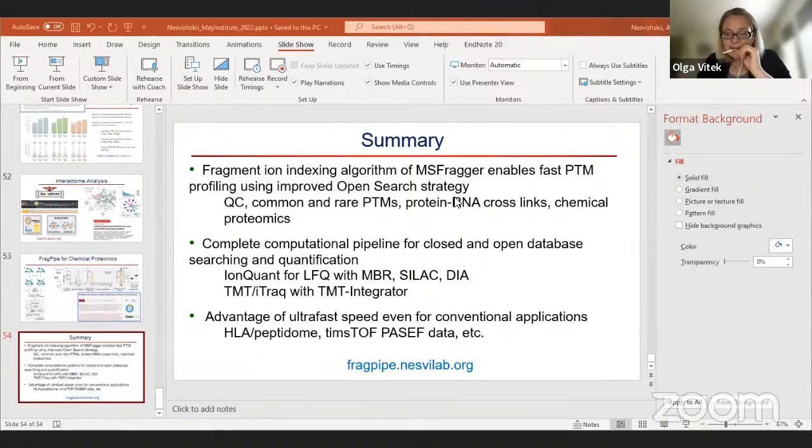And is there a limit on the number of PTMs for a search? I guess it relates to DIA. Well, conventionally, if you do the regular DDA search, or DDA or DIA, a closed search, we have 7 or 9 variable modifications that we allow by default. More than that, but PTM analysis is our bread and butter. So we work with groups to do all sorts of crazy stuff. That's why we have common mass offset workflows. We have labile workflows.